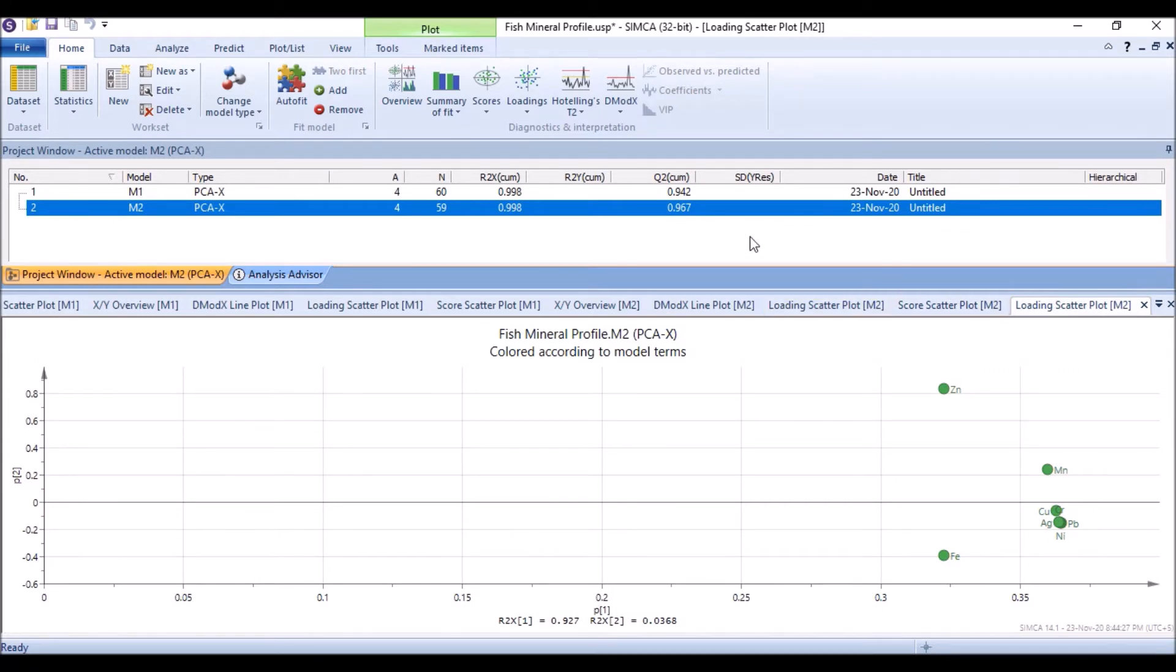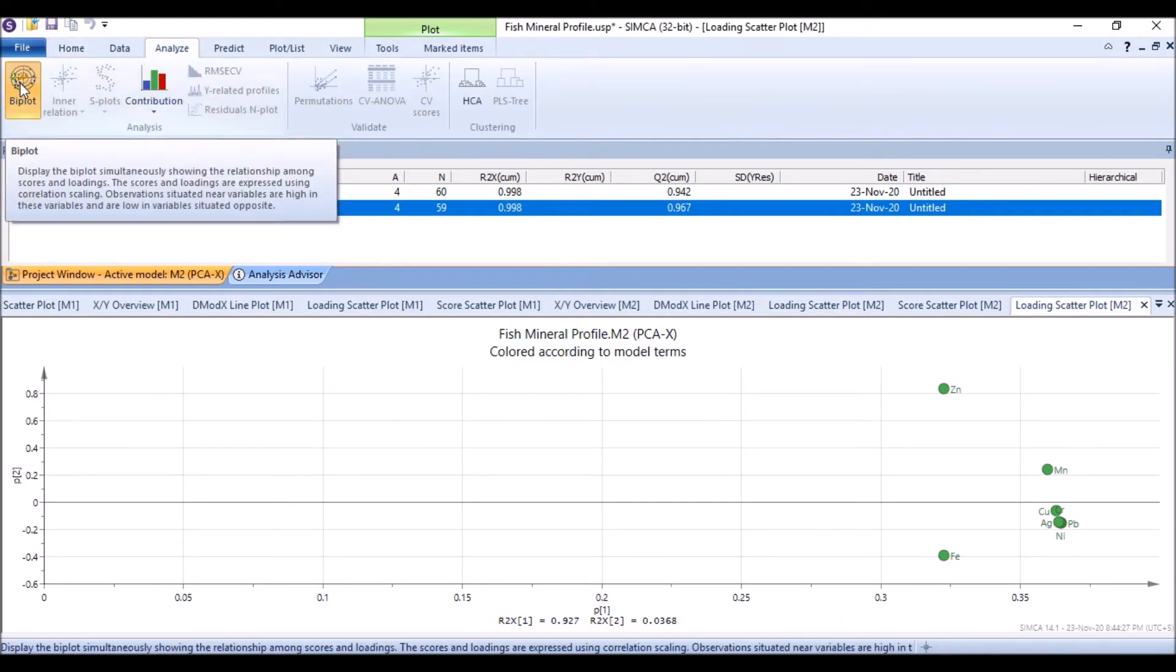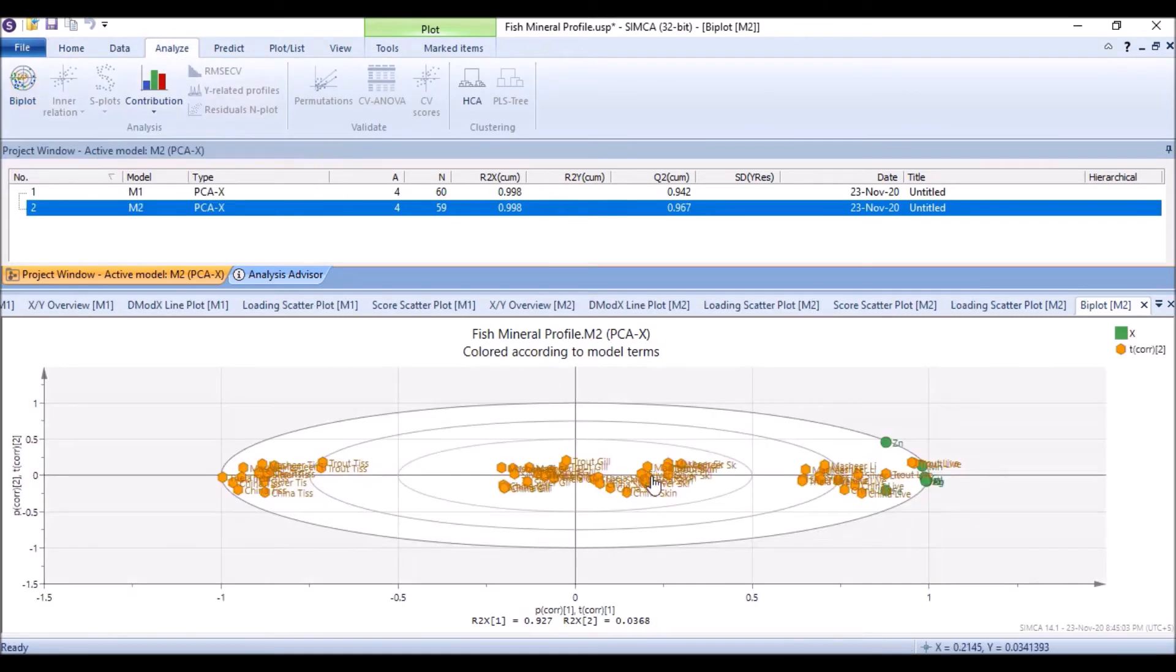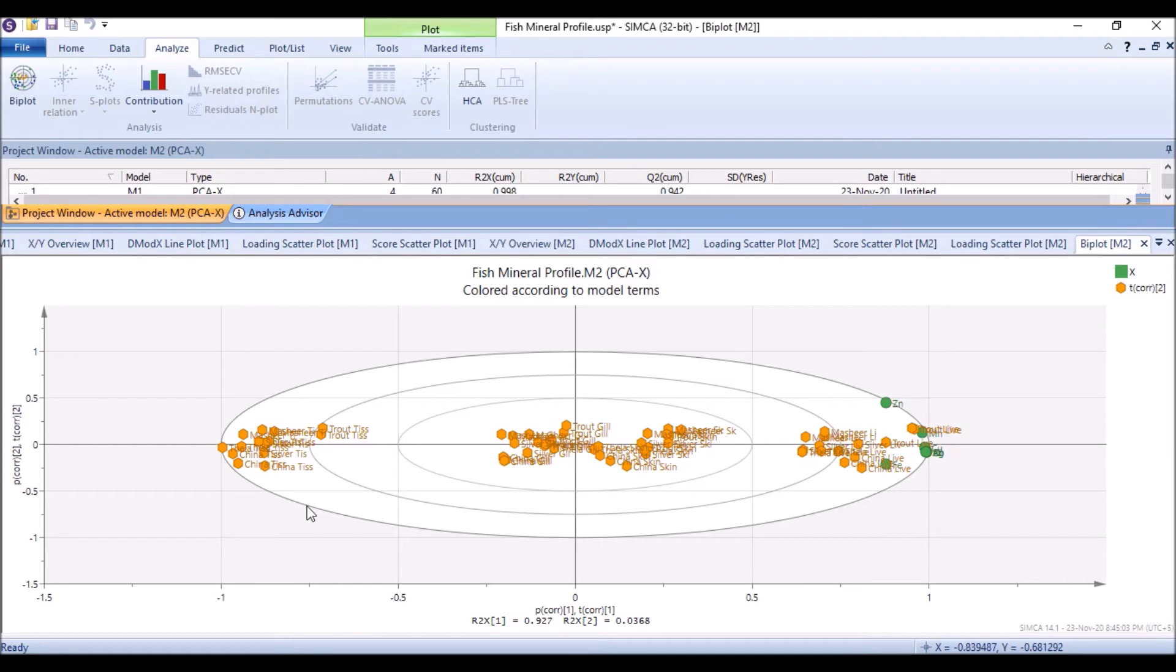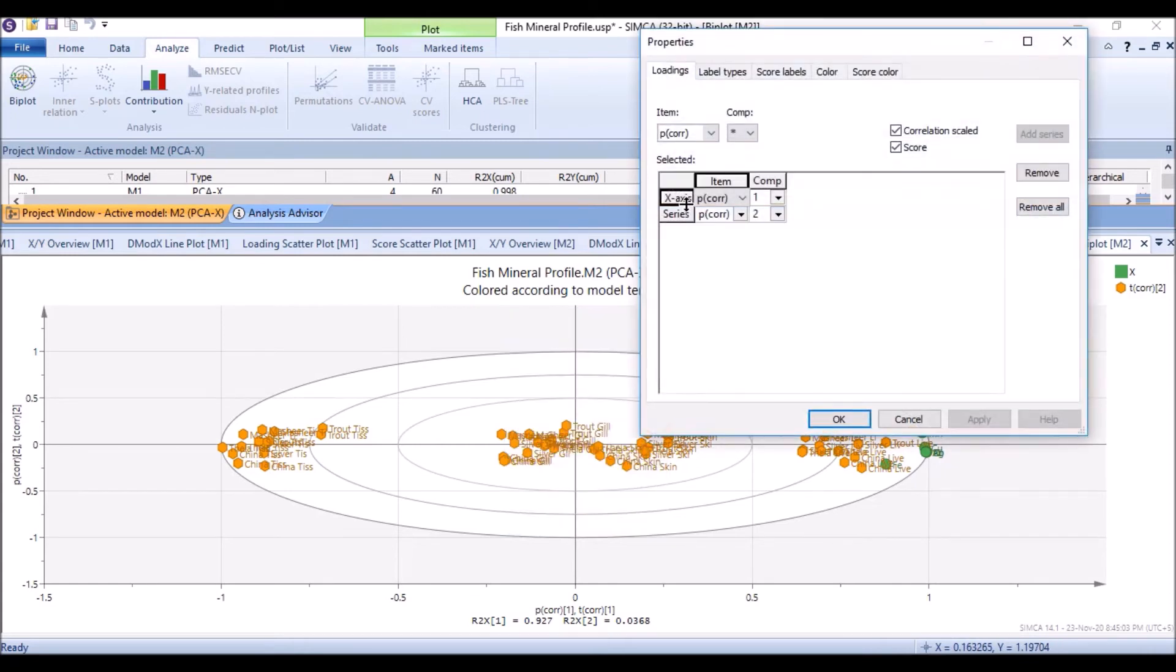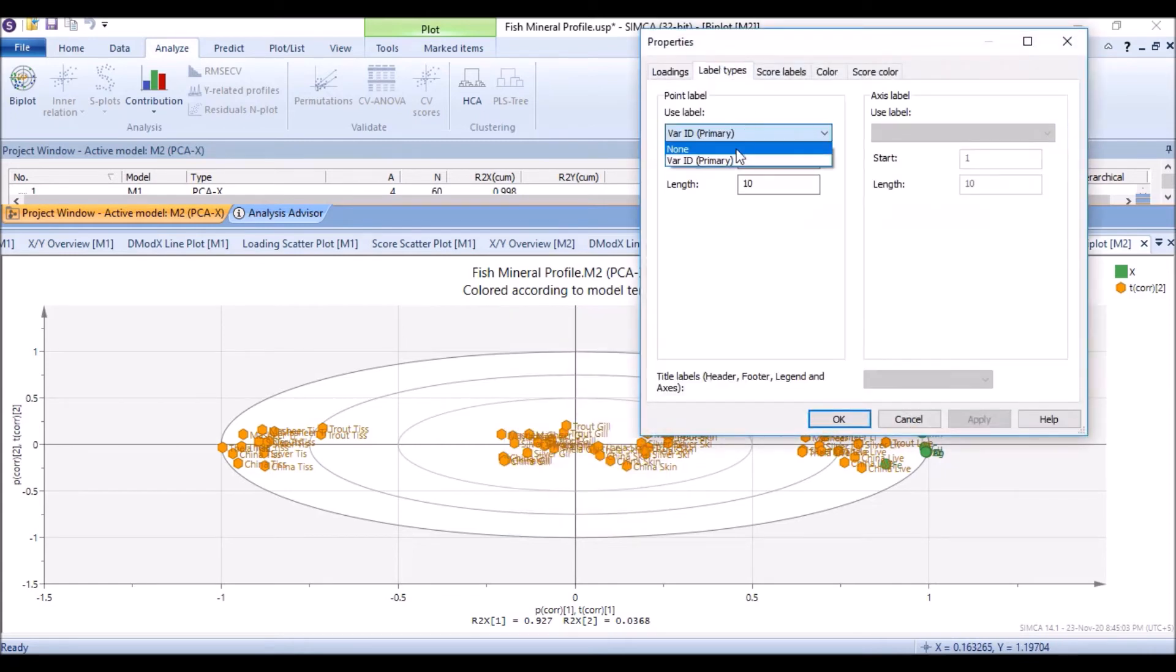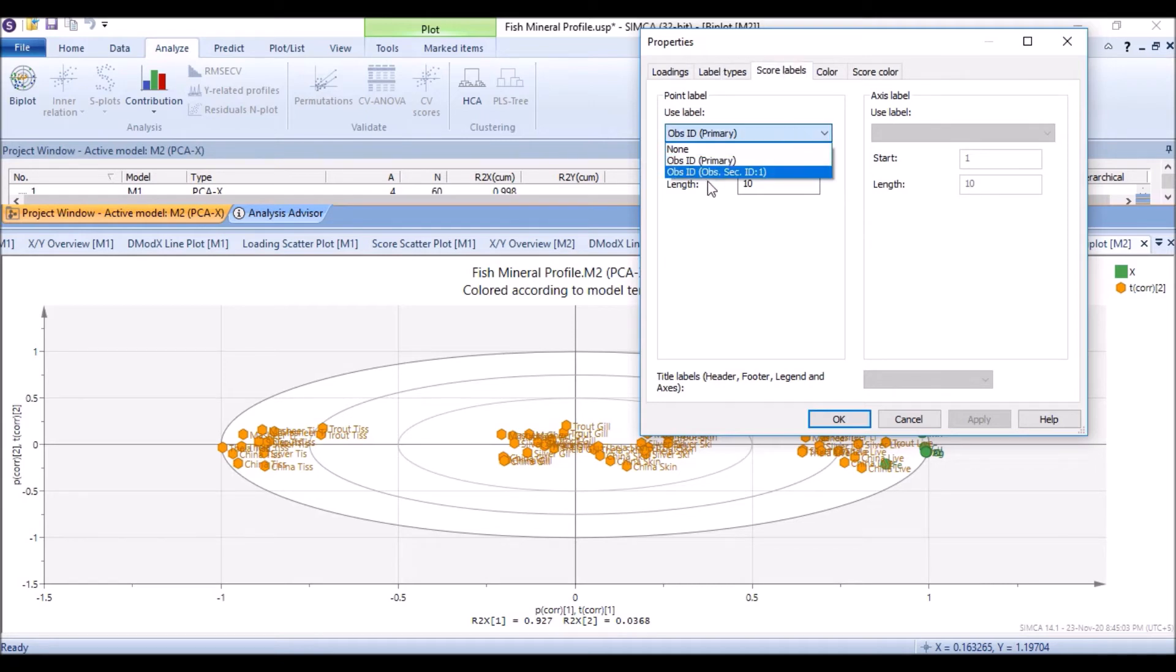Interestingly, we can combine these two scatter plot and loading plot in one plot also. So we go to analyze and then we see a bi-plot. In this bi-plot, if we see, it's quite clear. In the bi-plot we see our treatments, our samples, and then we see the variables. If I right click, properties, go to label, and then primary level. For scores we have primary and secondary and fish secondary, and then we have this beautiful plot.